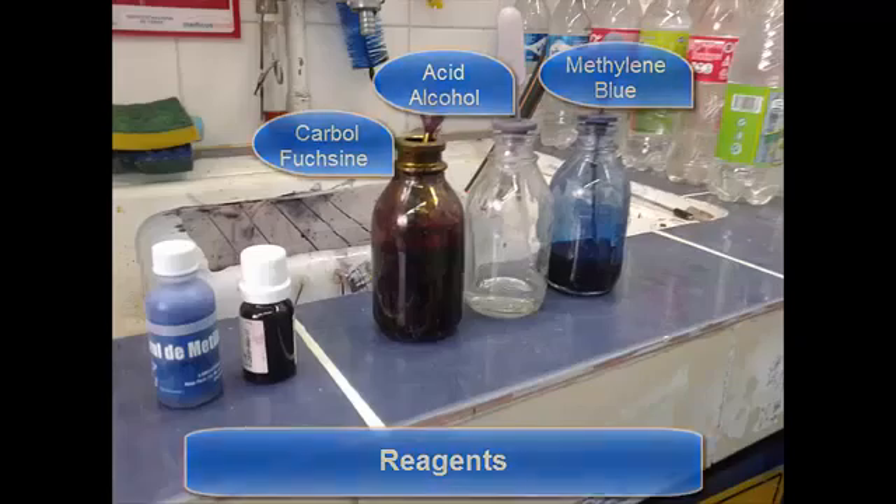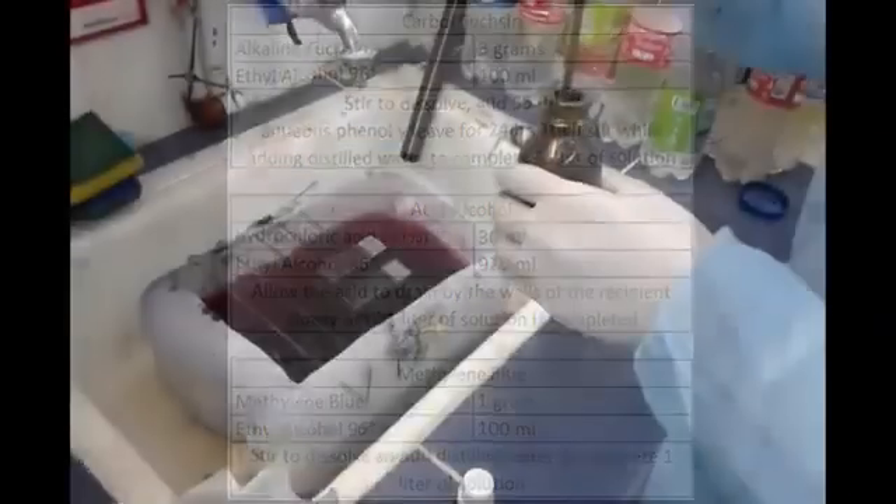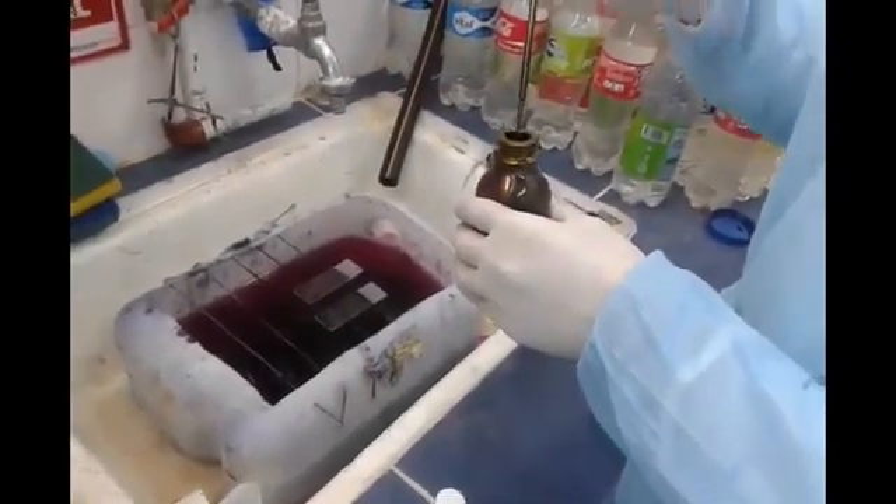For the staining process, the reagents are carbolfuchsin, acid alcohol, and methylene blue. First, we have to flood the entire slide with the carbolfuchsin solution.